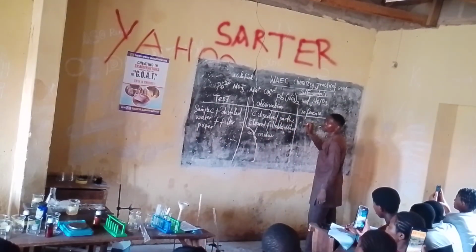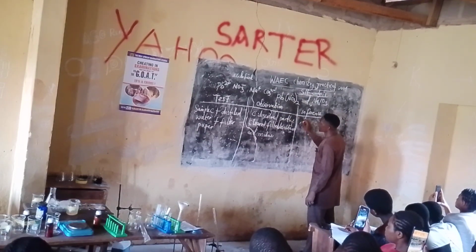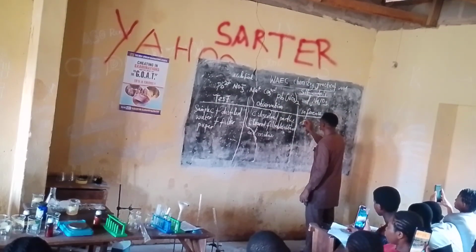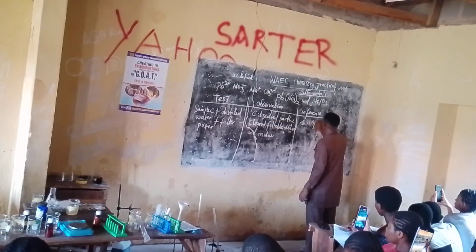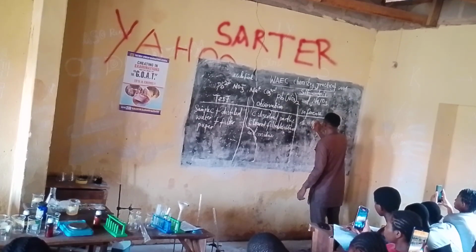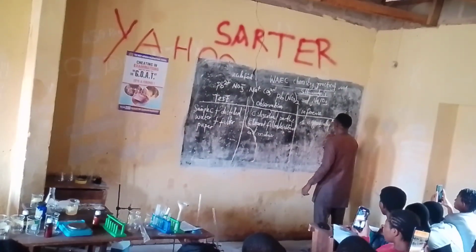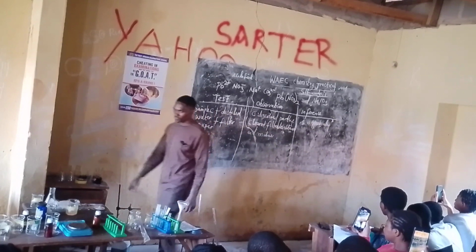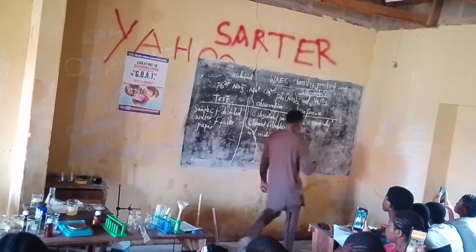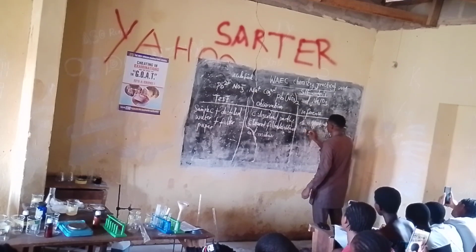So sample C is partially soluble in water. Are you with me? C is partially soluble in water.